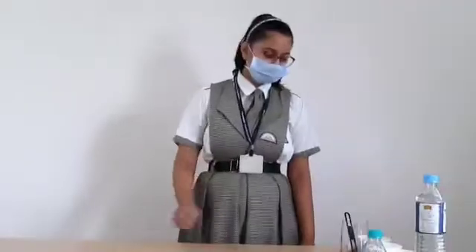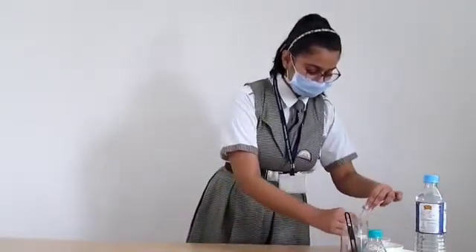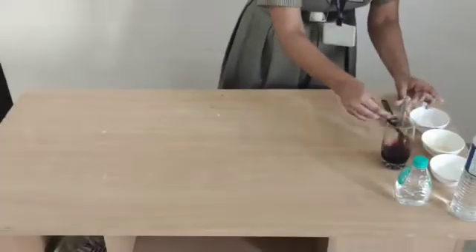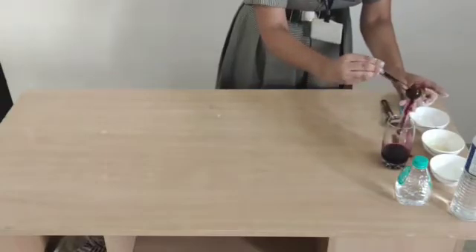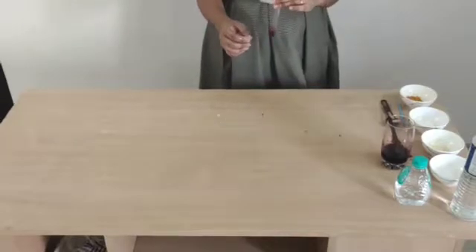Now, let's see which is acid, base or neutral by testing it with natural indicator beetroot juice. First we take baking soda in the test kit. The color changes into purple.